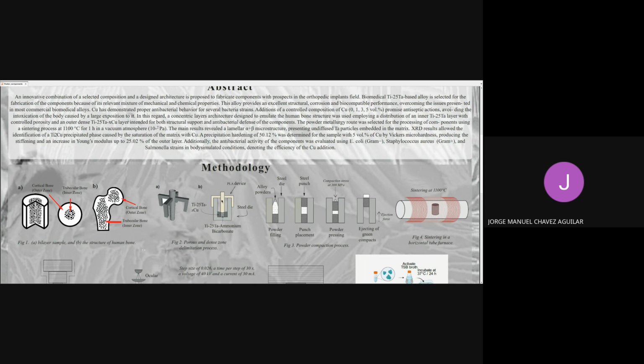This device allowed us to place the composition of the inner layer here and the outer layer on this side, so the layers are relatively separated from each other.